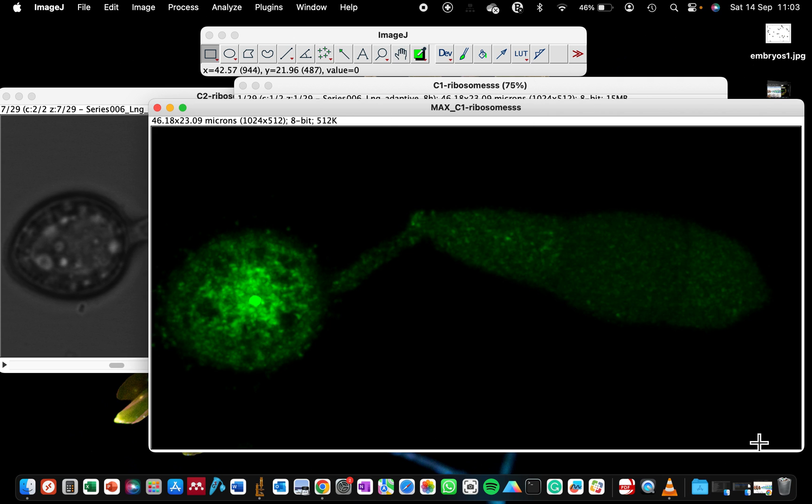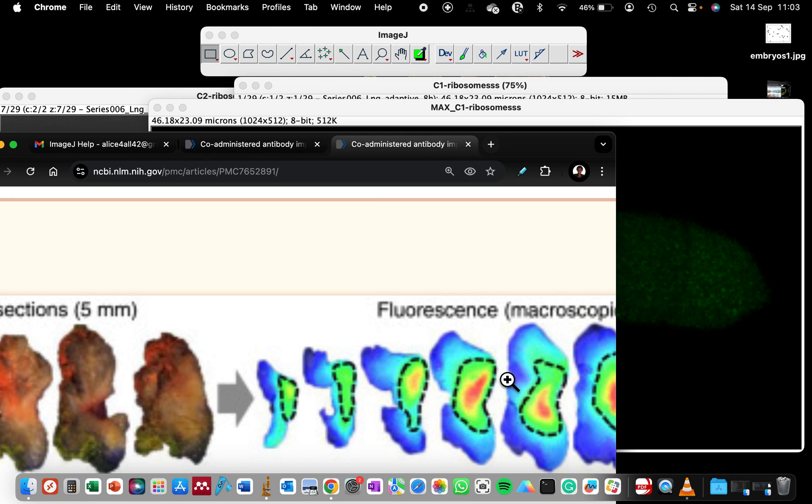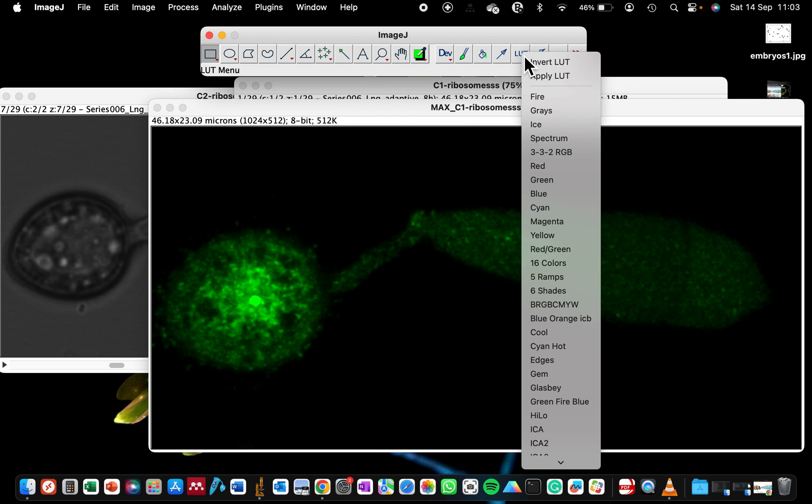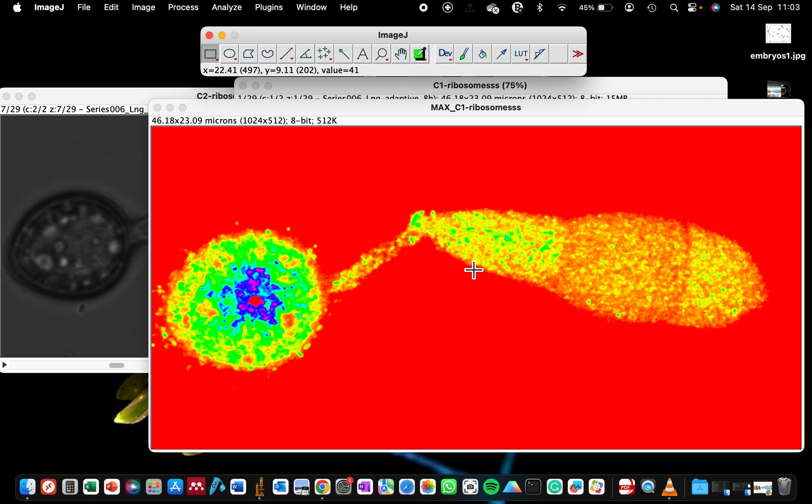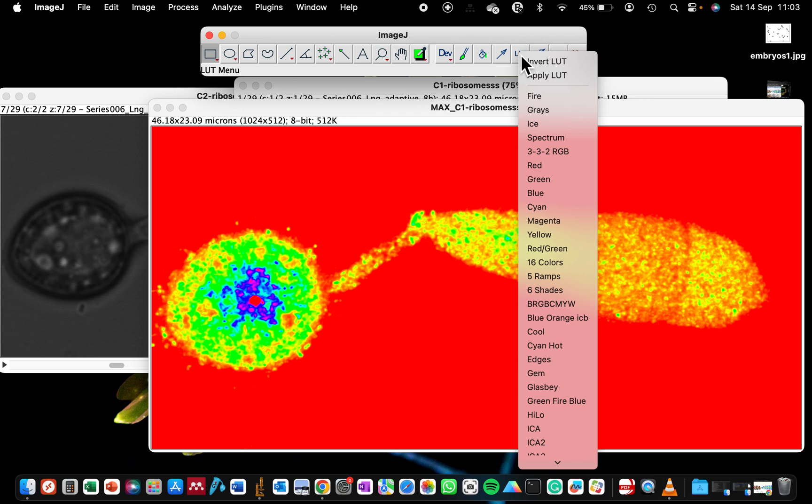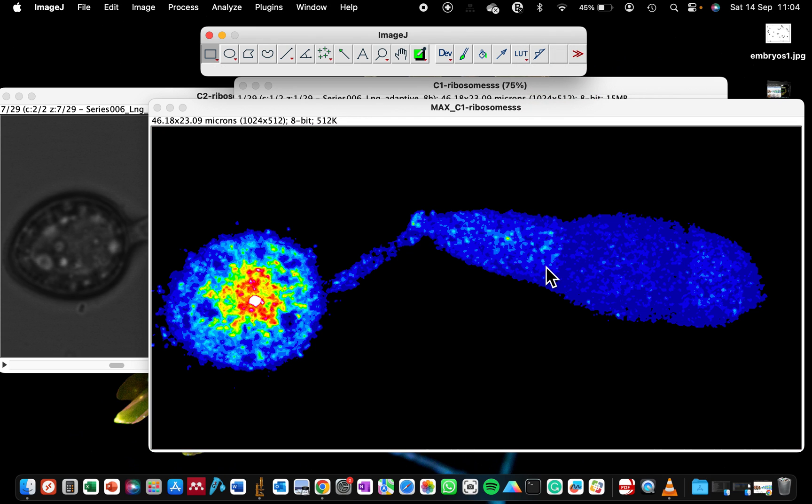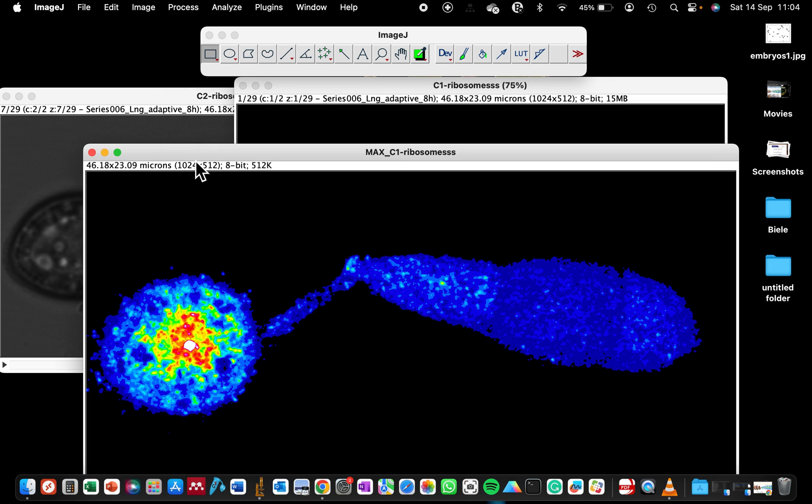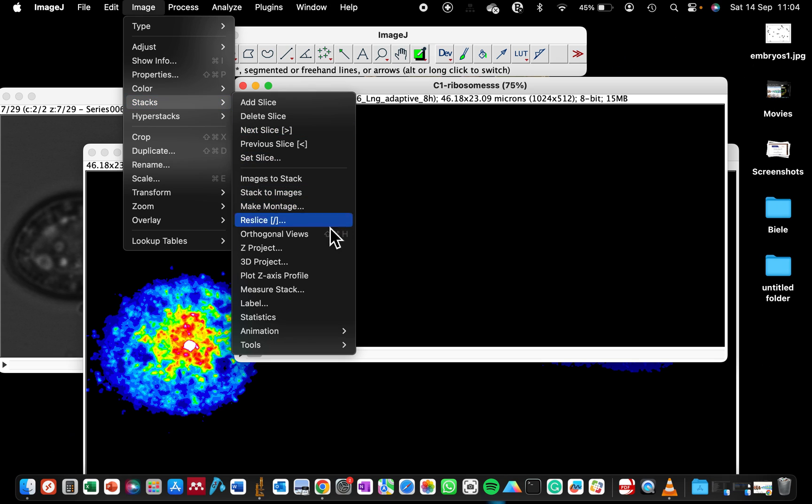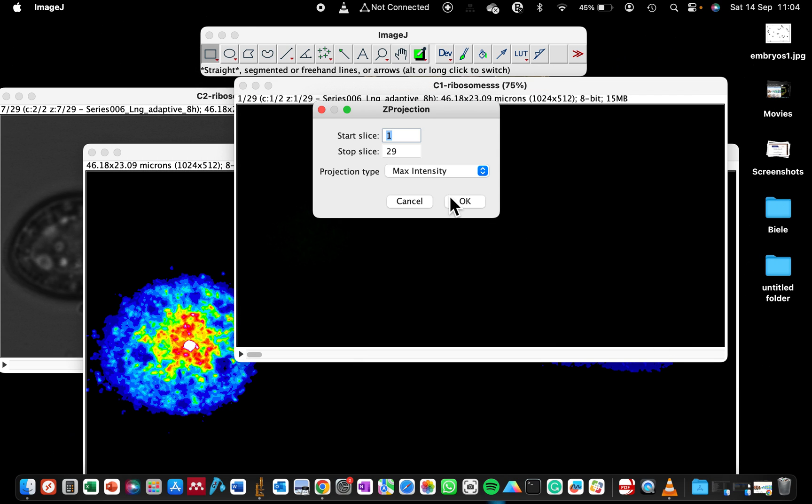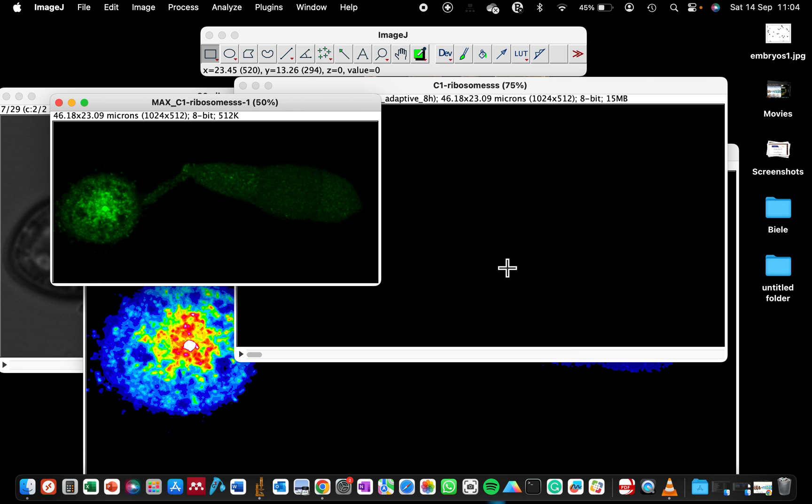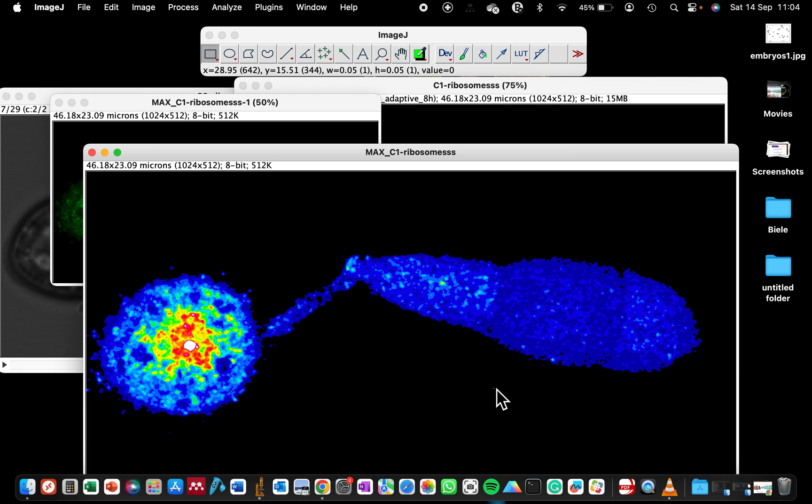To display it as a heat map like shown in this publication, go to the lookup table. You can use spectrum that will give you color coding, but using spectrum my black has also been shaded as red, so that's not a good color to display our heat map. Rather, I will choose the 16 colors. Using the 16 colors now I have blue and other areas where we have the stronger signal. Let me make another maximum intensity projection.